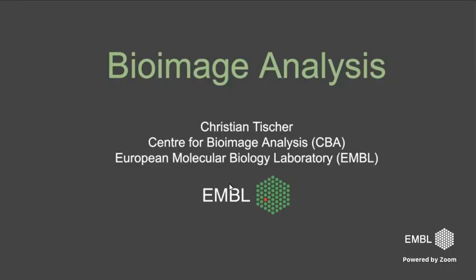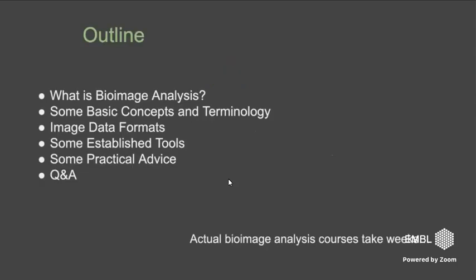Let's get started. So the outline: I will talk a little bit about what bioimage analysis actually is, some basic concepts and terminology, image data format, some established tools, some practical advice, and then we do the question and answers.